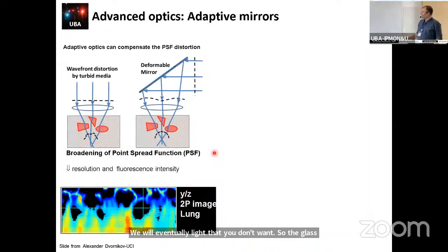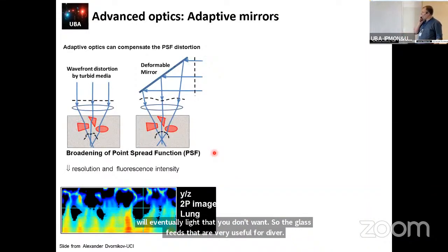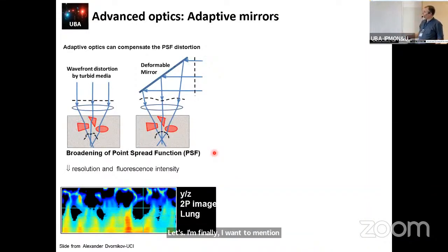And finally, I want to mention just quickly some new technology that is also important for DIVER, which is the adaptive optics or adaptive mirrors.